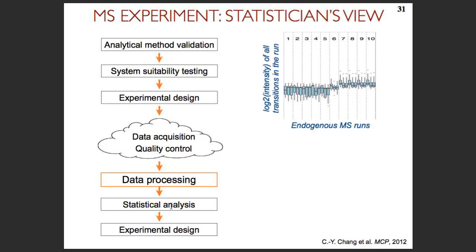Is that how it works? Right. So that actually doesn't look at the intensities. So it looks at samples. So what you will need to do, on one hand, is export the data from your experiments, let's say from Skyline or from OpenMS. So you will have something that looks like a tabular report, right?